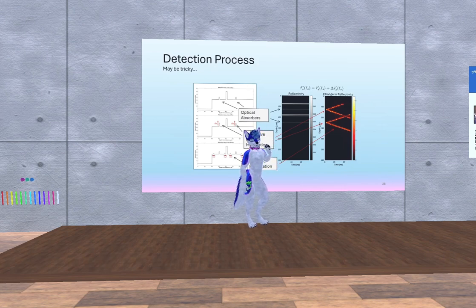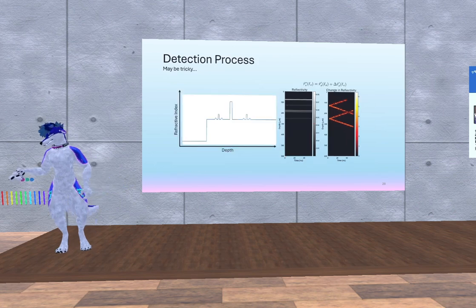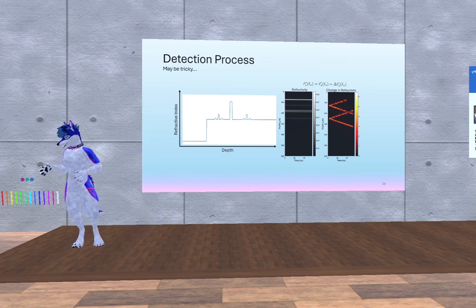Nothing's happened, right? But remember, this is a game of dynamic range. So let's take all of these subsequent A scans and subtract out the first one. And that's what we get here. Now you're looking at the difference in refractive index profile, the difference in the scattering profile in time. And now all of a sudden these absorbers light right up. Okay, that's interesting, right? This was a video, but it didn't occur to me that this wouldn't play. But imagine they're animated. Just imagine in your brains.